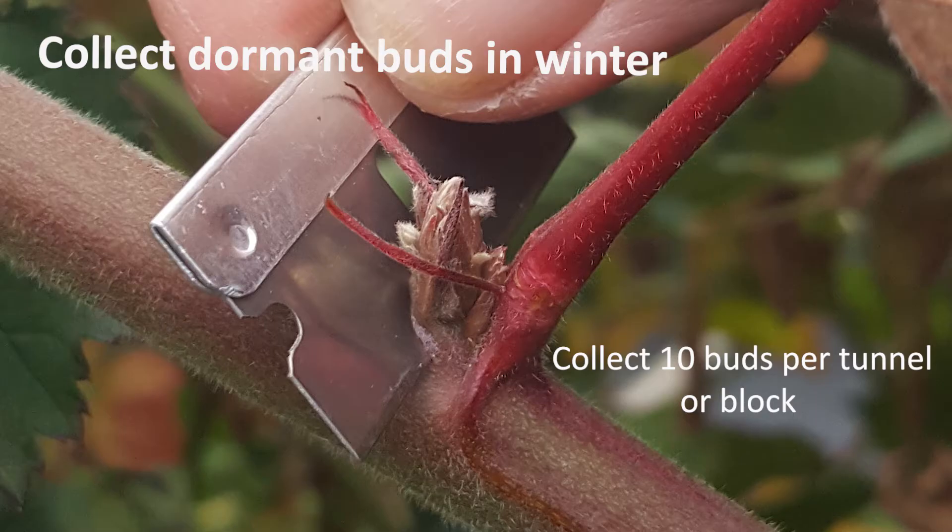The first thing you're going to need for bud sampling is buds, so we recommend going out into whatever block or tunnel that you believe might have red berry mite problems, or you might just want to survey your whole crop, and get 10 buds per block. It's done pretty easily using little safety razors, but you could easily use a safety knife like a Stanley knife to safely get the buds away and chip them off, leaving them as intact as possible.